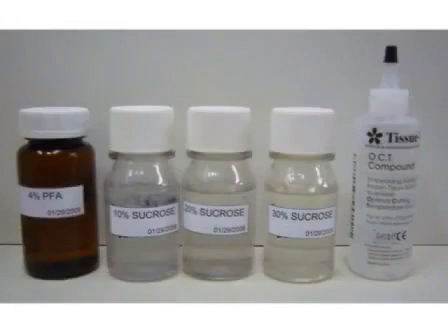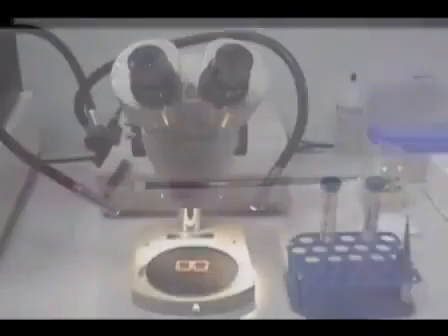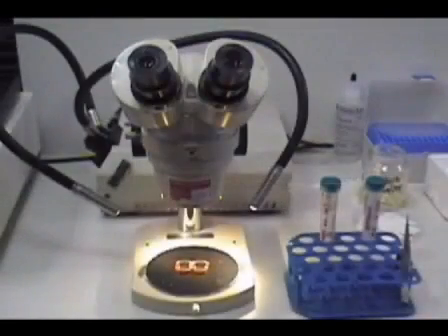Materials and equipment. For this procedure, we will need an embedding medium for frozen specimens, 4% paraformaldehyde solution for fixation of the cells, sucrose solutions for cryoprotection, a needle with a slightly bent tip, a stereo microscope for better visualization of the EBs, and a shaker.